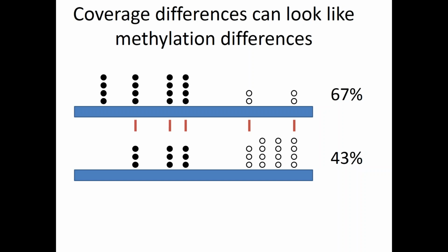In those cases, you either just have to live with the artificial differences that get inferred and work out when you get your hits whether that might be the cause, or you do something where you try and impute the missing values to give yourself more comparable values. And just to illustrate that this isn't just a theoretical concern, here's some real data.